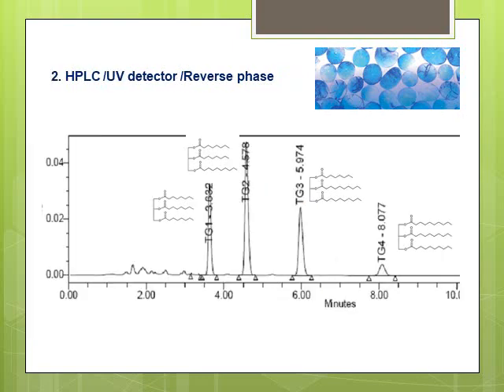The next technique is HPLC with the UV detector. Similar to previous slide, the column is a C18 and the mobile phase is a high acetonitrile. The wavelength in this case is around 200 nanometer. So mobile phase of methanol concentration is not going to work because it will give you very noisy baseline. The chromatogram, similar to before, again shows us 4 peaks, and the assignment is similar to previous slide. With this method, we also can do the quantitation, and also we can do grade determination.